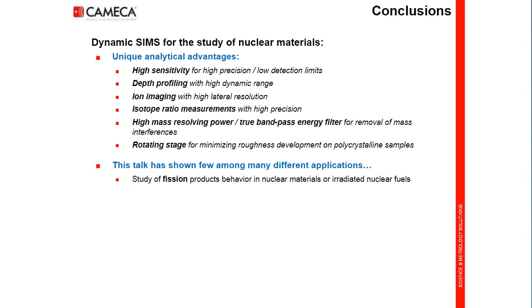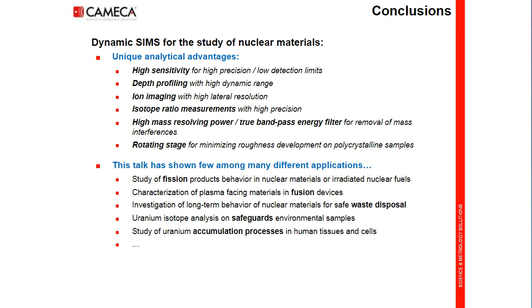Other applications include the characterization of plasma-facing materials in fusion devices, investigation of long-term behavior of nuclear materials for safe waste disposal, uranium isotope analysis on environmental samples collected from nuclear handling facilities, as shown before, and study of uranium accumulation processes in human tissues and cells.